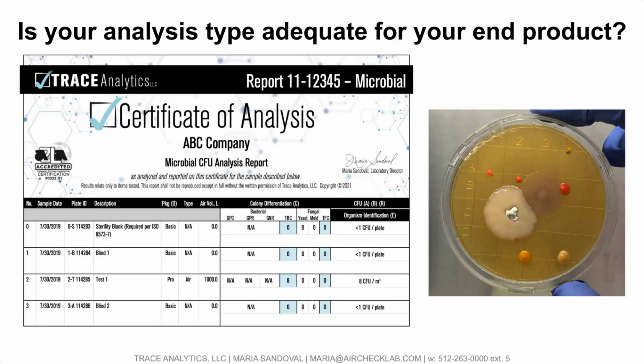And so this is the level of differentiation that the laboratories see from compressed air. This is the level of variety that we see. When you guys get the reports, all you're seeing is an enumeration if you're choosing the basic package.